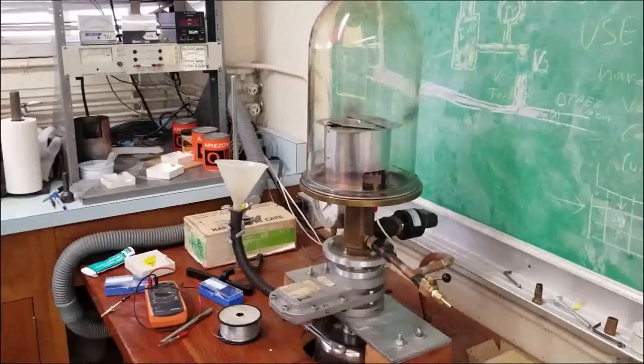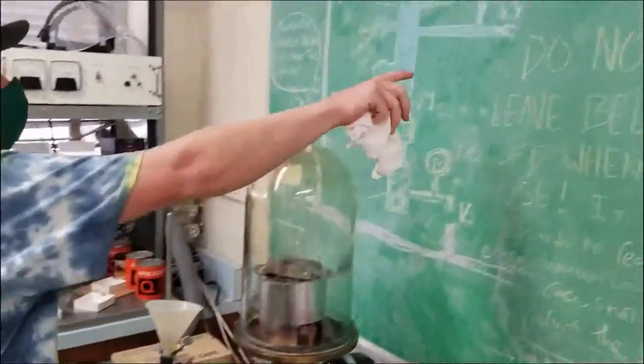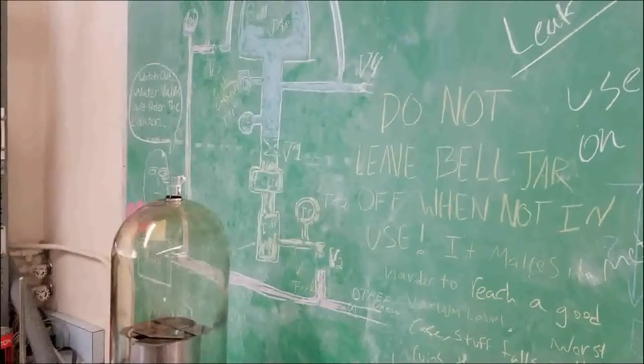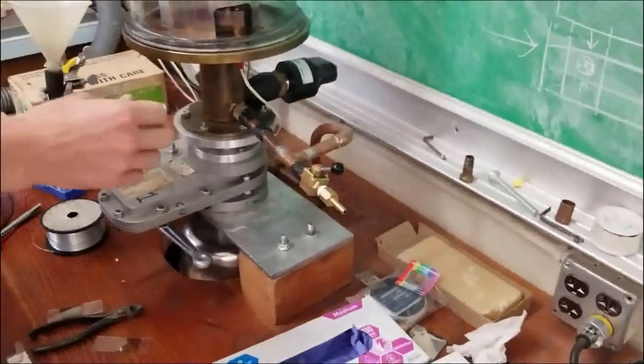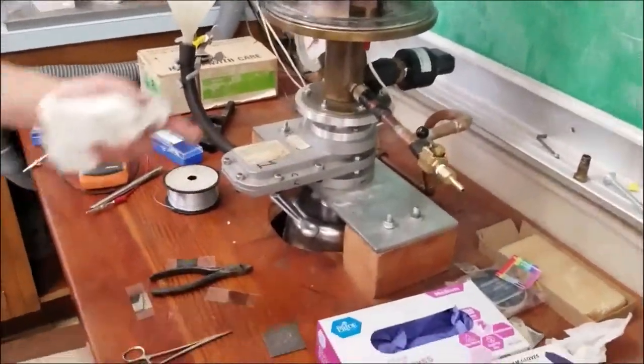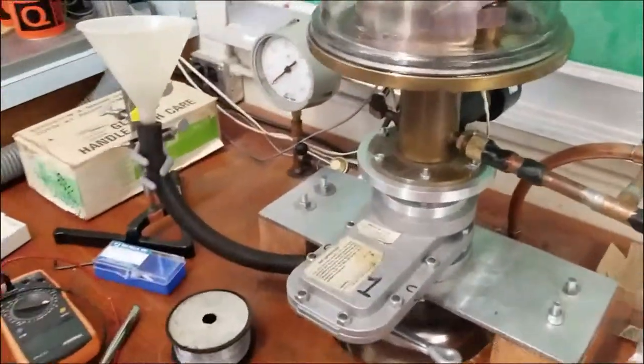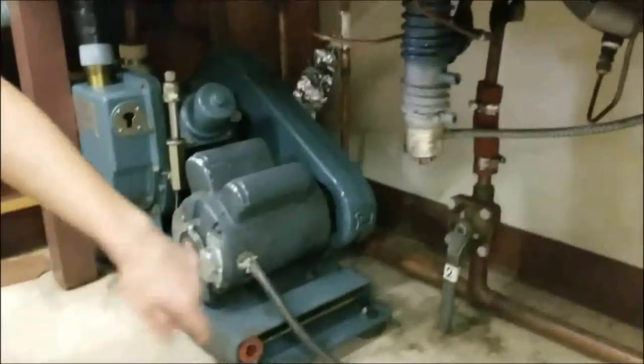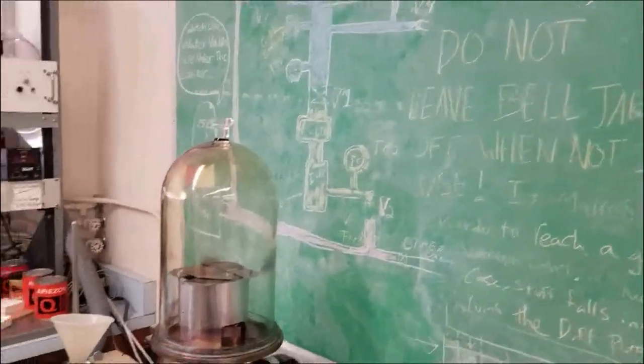So the first step in this is just to get most of the system, as much of the system possible to low pressure. So what are we going to do? We're just going to close the pump to the atmosphere, open up everything else and just turn on the mechanical pump. Nothing really is going to happen. We're just going to get this down to low pressure. So turn off valve four which is this one. Turn on the mechanical pump. In general, in line means open for all valves except for this one. It's labeled on here though.